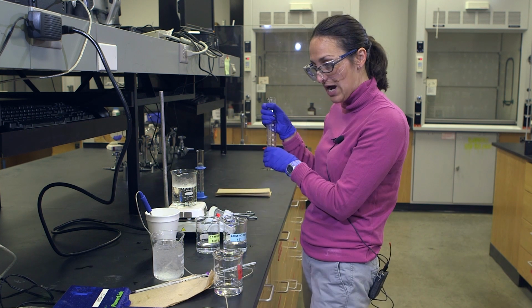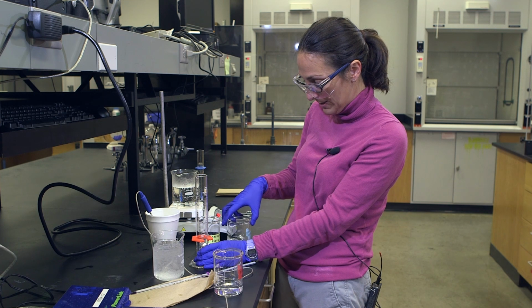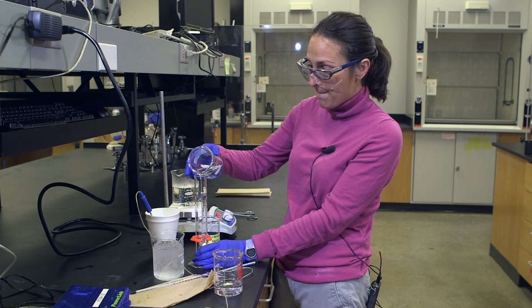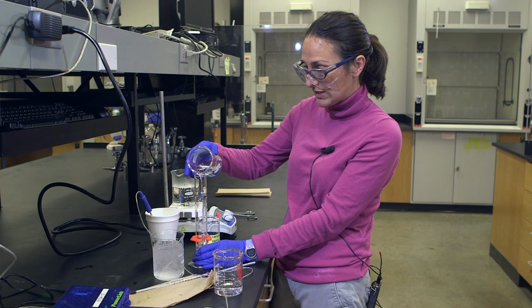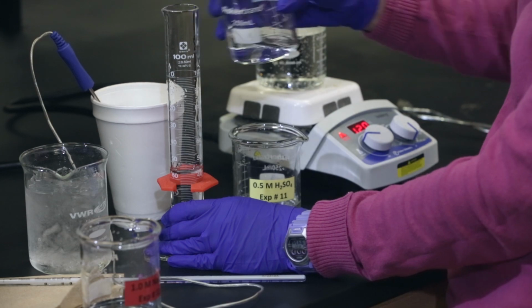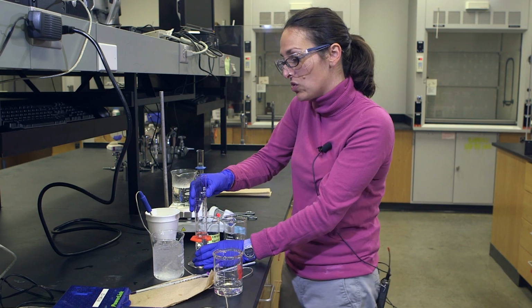I'm going to rinse this out or use a different graduated cylinder for my acid. I need to measure the same amount of acid or I won't have accurate enthalpy of reaction. So the same amount, I'm going to make sure I get down at eye level and record that meniscus.